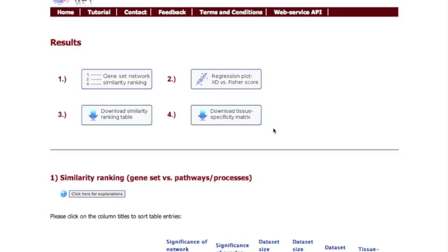The results page provides multiple outputs that are accessible via the buttons at the top of the page. I will first discuss the gene set similarity ranking table.